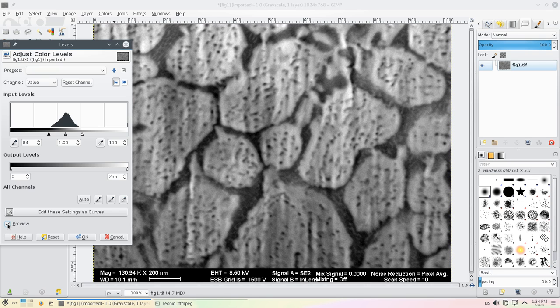I should notice that by stretching, actually, what I'm doing is stretching the image. So by stretching it, some actual data of the image is lost. But the visual data, what the eye perceives, actually looks better and reveals more details to our eye.